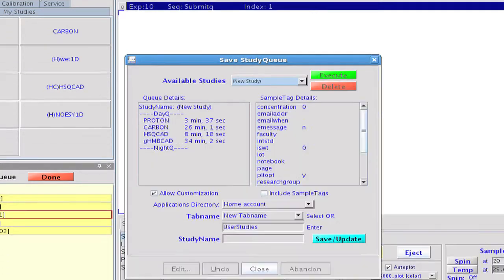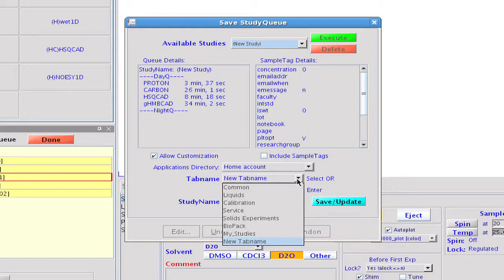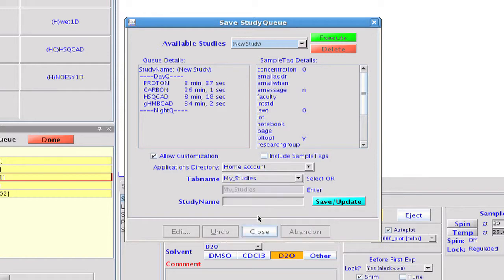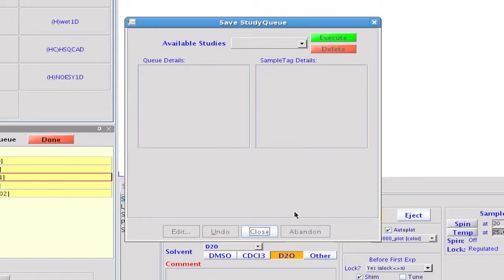Now we can use the Clone Current Study option to convert our new study into a clone. Like before, we get the Save Study Queue pop-up. This time, we'll select the same My Studies tab as we used before to hold the new clone. We'll name our study QuantExplist to signify that it is more than just one experiment. And we'll click the Save Update button to store our new clone.